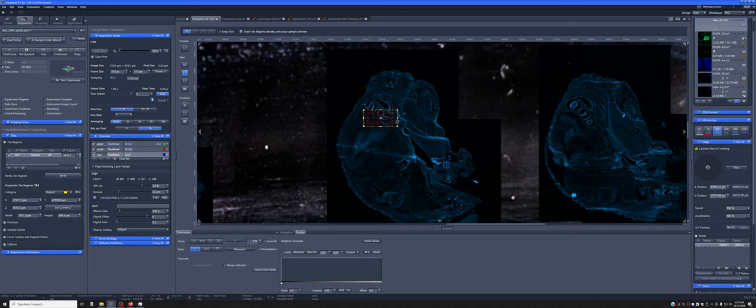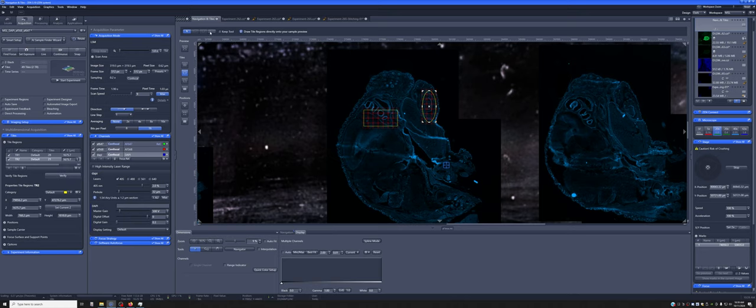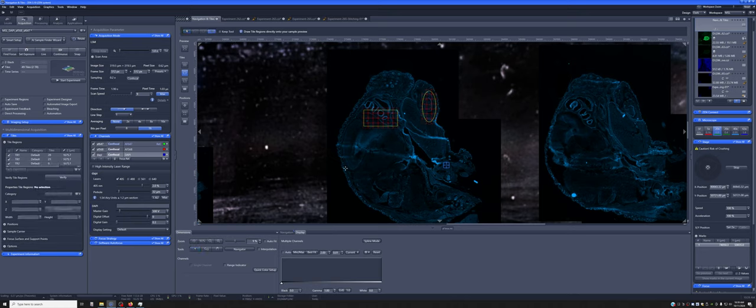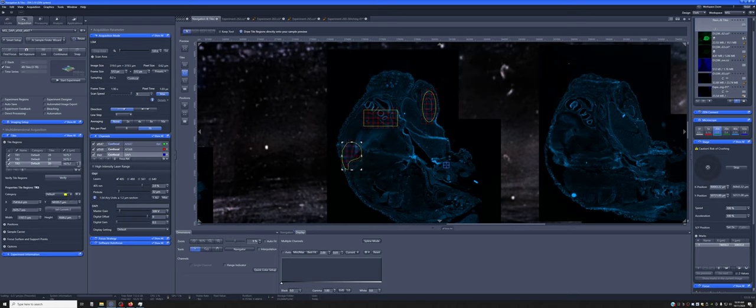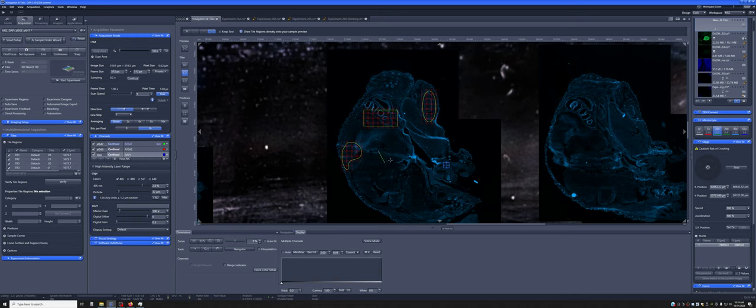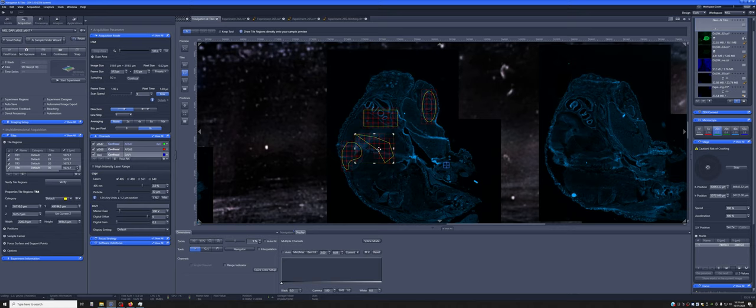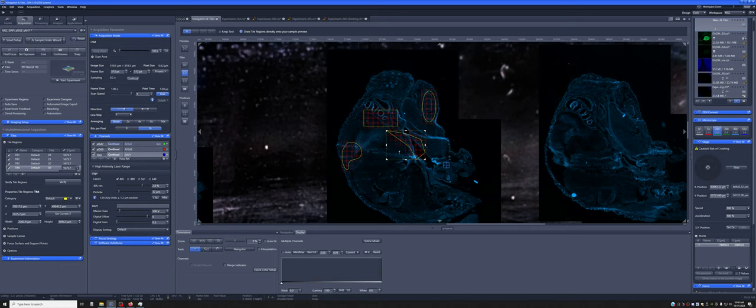And the drawing can be a rectangle. It can be an oval. Or it can be a free-floating region, which you press and hold to draw and then right-click at the end. Or you can press and click, and this makes waypoints that then get joined. And so you can see this has the advantage that it doesn't include things that are outside of the shape. So it doesn't try to make it a rectangle.